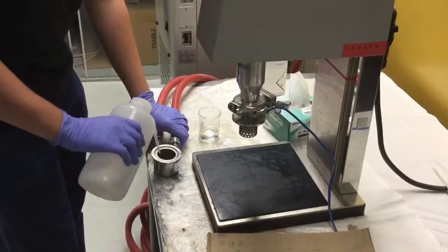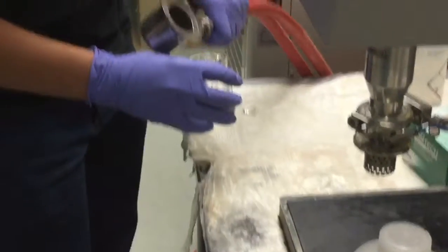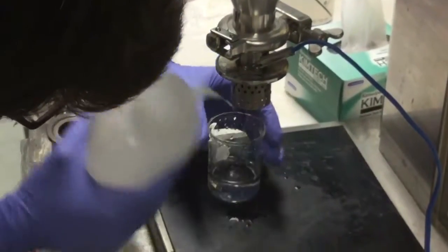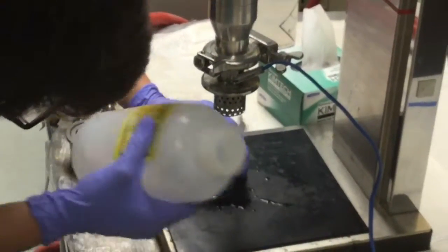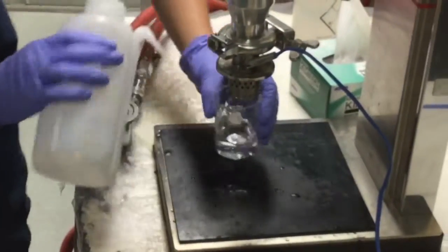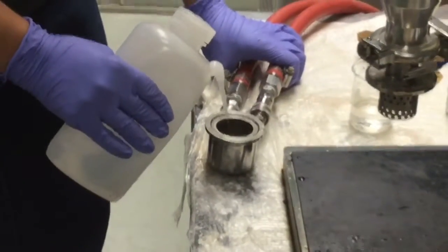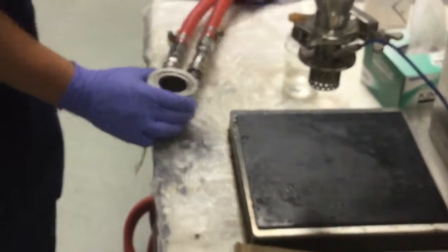Once the run is finished, rinse both the container and the blade with DI water. Then fill the container with about 20 milliliters of DI water and run for one minute to clean.